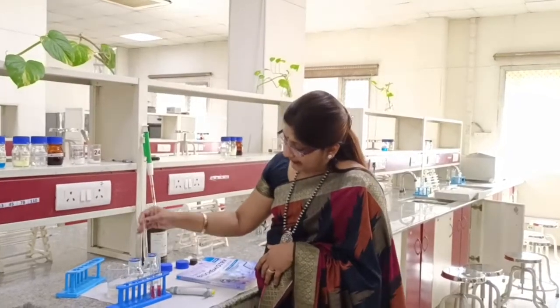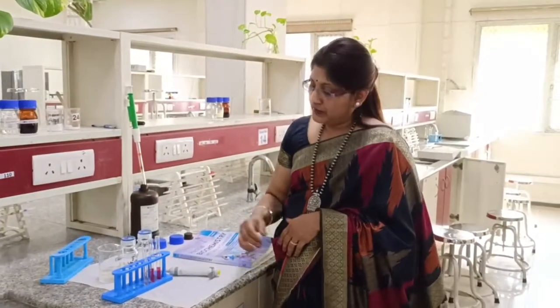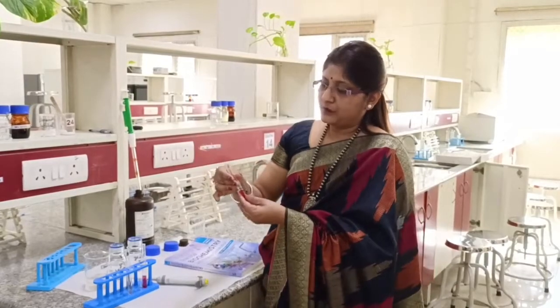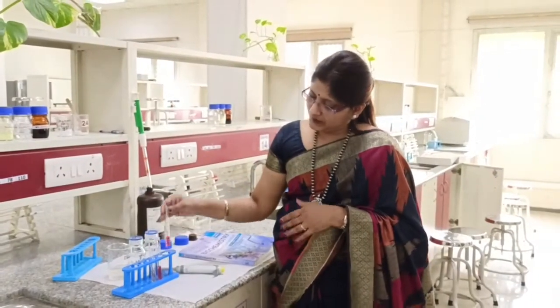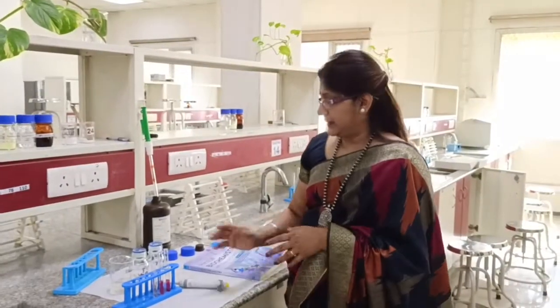In this method of assessment, we use the concept of the colorimetric principle, measuring the colour developed by the coloured dye. The blank tube's colour is nullified by adjusting the colorimeter to zero. After that, the optical density (OD) of the standard and test solution is measured. Taking this OD — that is absorbance — we calculate the amount of glucose in the given test solution. Because we already know that 100 milligram per deciliter of solution gives a specific OD, we can mathematically determine how much glucose is present in the test solution.